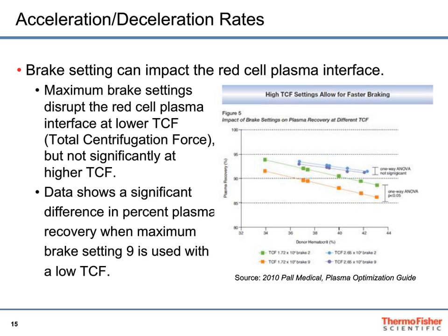We recognize that. But there are some customers, blood bankers are a special one, but also people who are running gradient work, and especially sucrose gradients that are fairly gentle gradients. There is the need to make sure that the acceleration and deceleration don't mess up what you just did in the run.